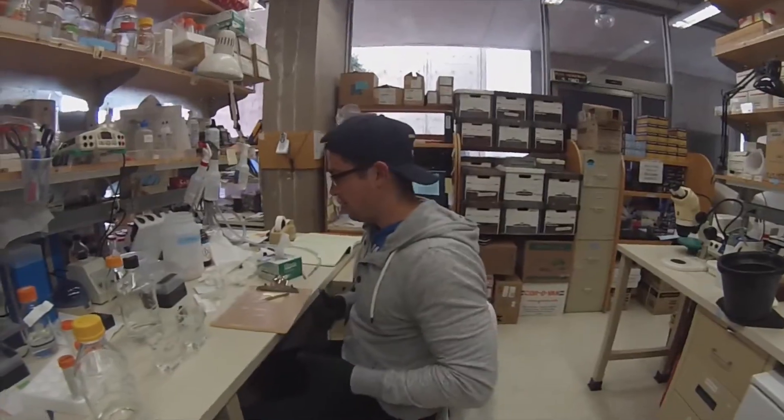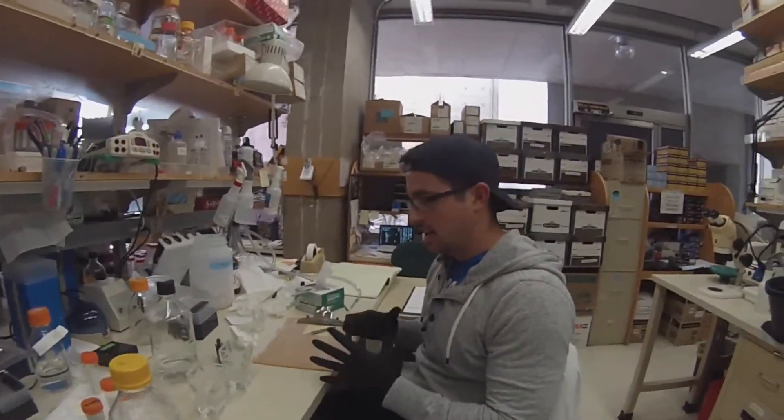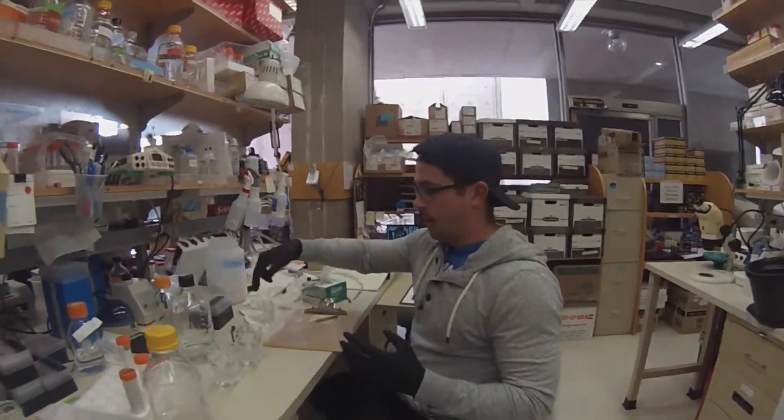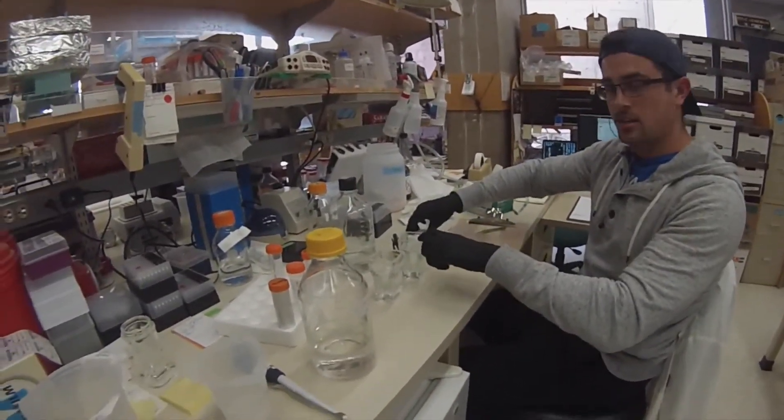Today I'm going to be talking about how to mount the coverslip to a slide. I'm going to be showing you some of the slides that I used in the previous video, where I was sectioning on the Cryostat.